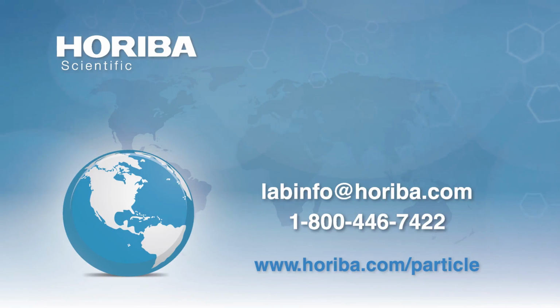You can automatically program it so that when you put the second fluid addition in, you want it to be, say, between 99 and 101%. So you can program it to do that checking for you, or you can just glance at it after you've cleaned up and put the fresh fluid in, and say, yeah, this is 99%.